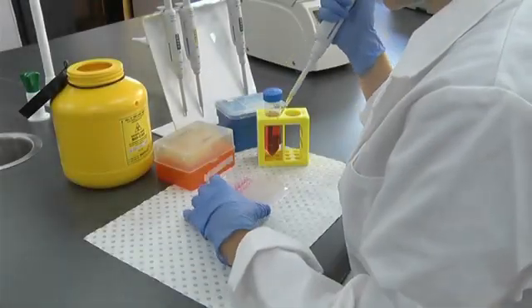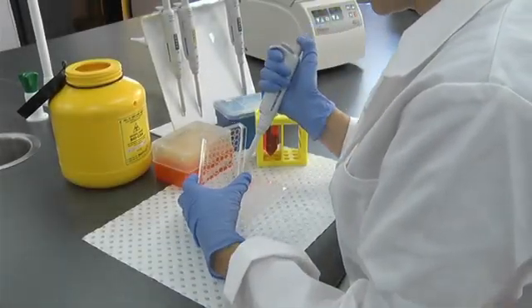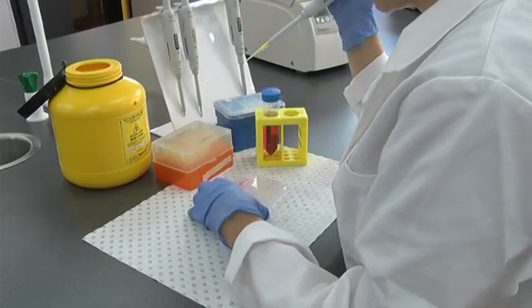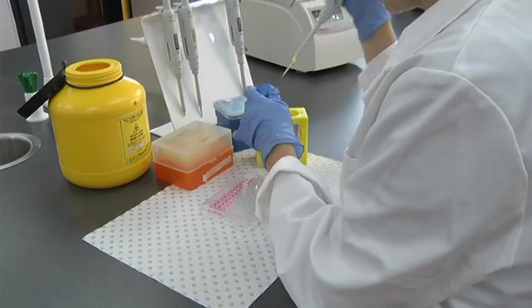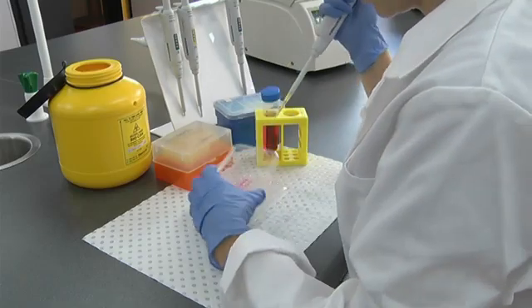Experiments need to be performed in a repeatable manner. An important way to help achieve this is to strive for both accuracy and precision in your pipetting. But what do we mean by accuracy and precision?